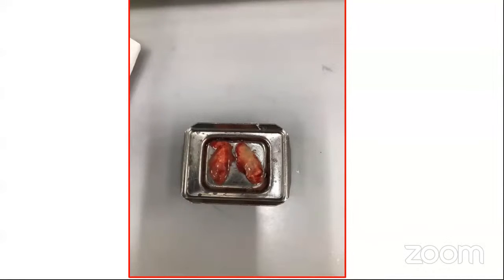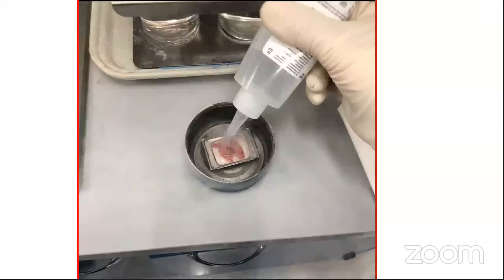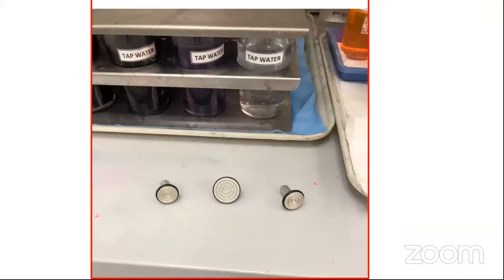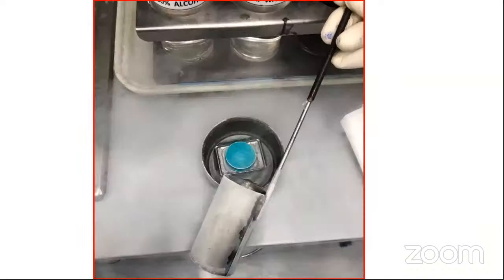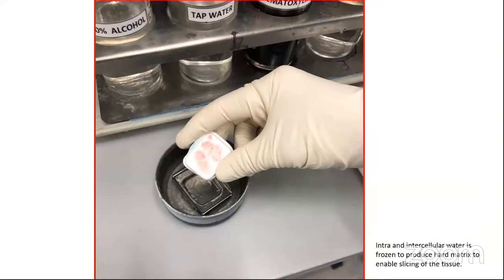And this is another fragment of tissue that came along with the cyst. Those are the multiple fragments that came along with the cyst. Now we use liquid nitrogen to freeze the tissue. We add more OCT, and we put a chuck on the tissue. We choose the chuck: we have small, medium, and large chucks, depending on the size of the tissue that we are fixing and freezing. We add more liquid nitrogen. It's almost ready, and now we have the block.